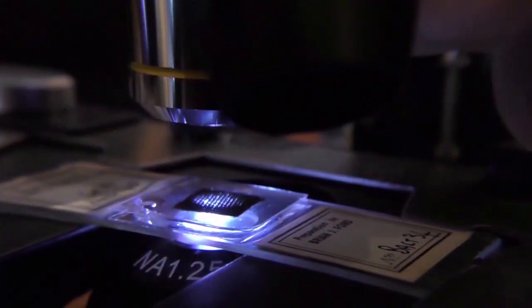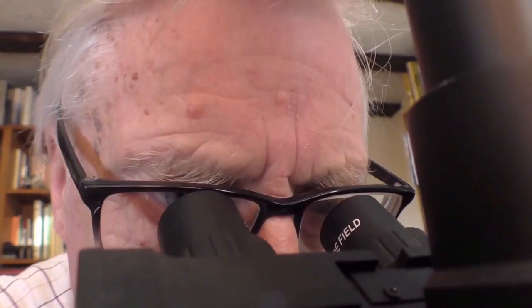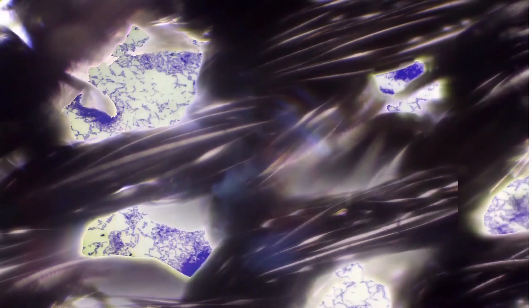However, the specimen was not mounted on a fresh slide but superimposed on a crystal violet stained preparation of bacilli, several microns in length and one micron across.